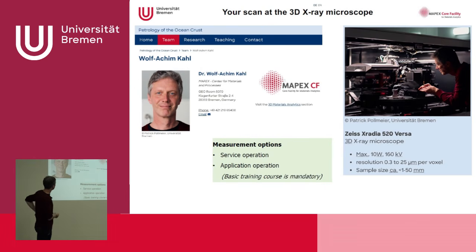Yeah, so basically you can now become a customer of this lab. And if you do so, there are two possibilities. You can measure yourself. If you have a lot of samples, it's really good maybe to get a teaching course, a basic training course, which is mandatory, and then you can use this device on your own.